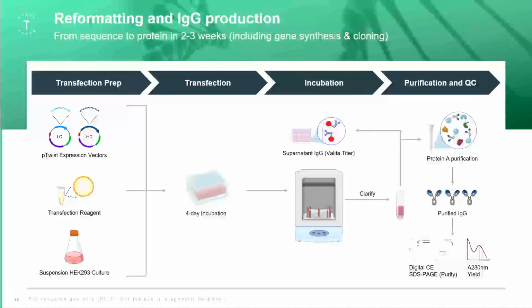Now, this workflow is very automated. It's built with a set of Hamiltons. We don't necessarily have to use HEK293 cells. We can use ex vivo, but for this case study, we did use HEK cells. So, as I mentioned, it was a GPCR target.